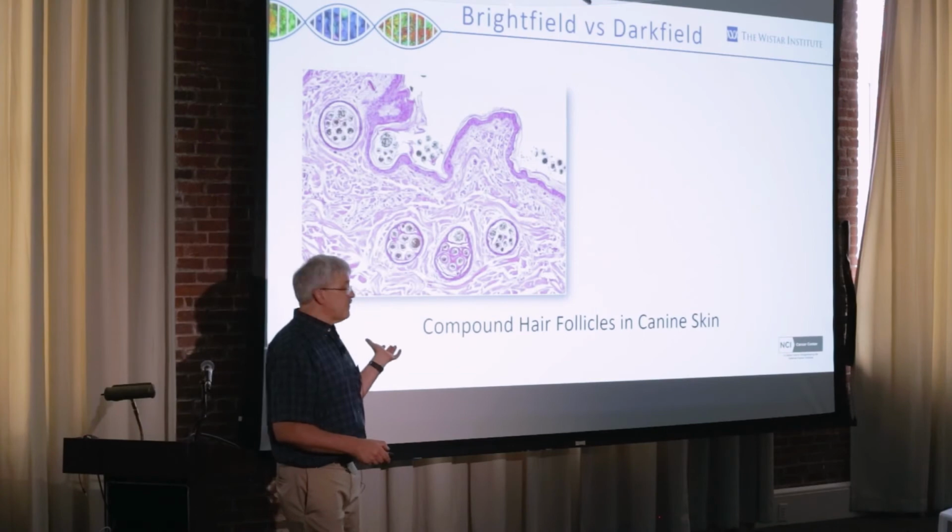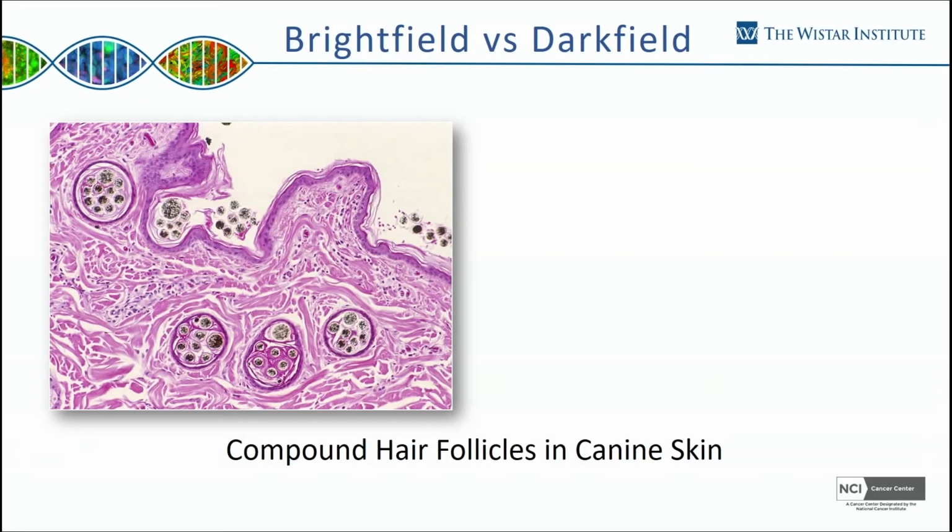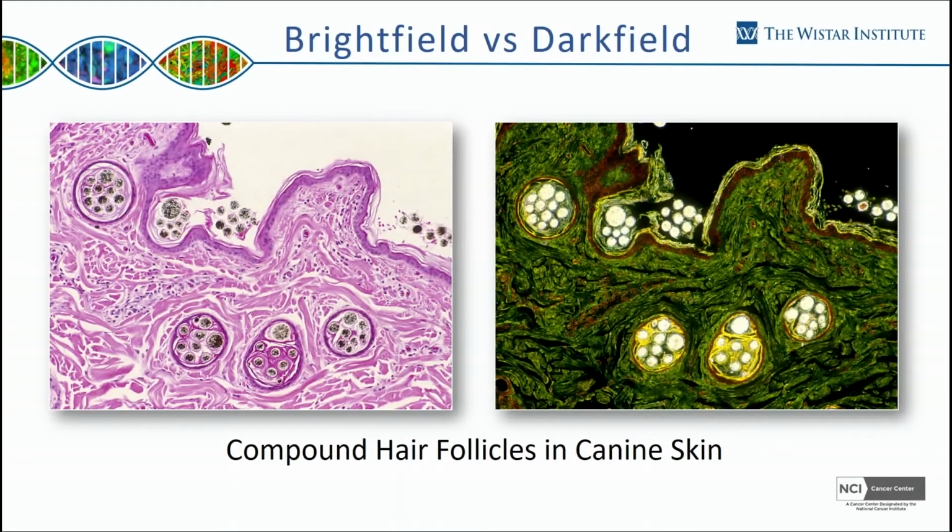Now, what can you do with dark field? Let's take an H&E section and look at it with dark field. That's kind of cool, right? If you want to play a little bit, this is actually the first picture I ever sent into the Nikon Small World competition. Very first picture I ever sent. I got 7th place many years ago. And that was just playing with a demo scope, by the way. So that's the importance of demos.